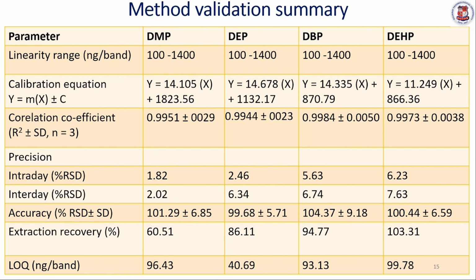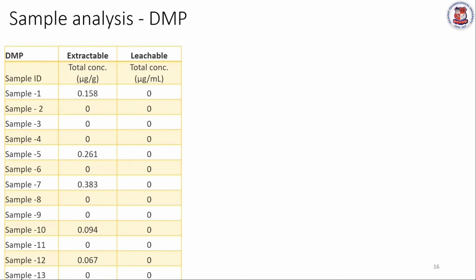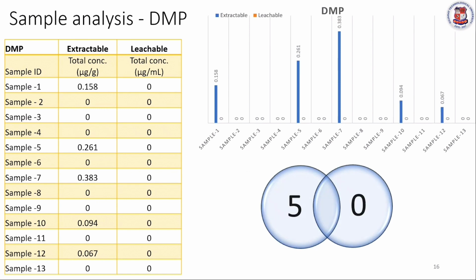There is a linearity range, equations, precision, recovery, LOQ. So we have succeeded in doing the analysis from 100 nanogram per band, which is quite sufficient for this kind of study. And looking at the data of precision and accuracy, we can say that the method can be useful for the desired applications.